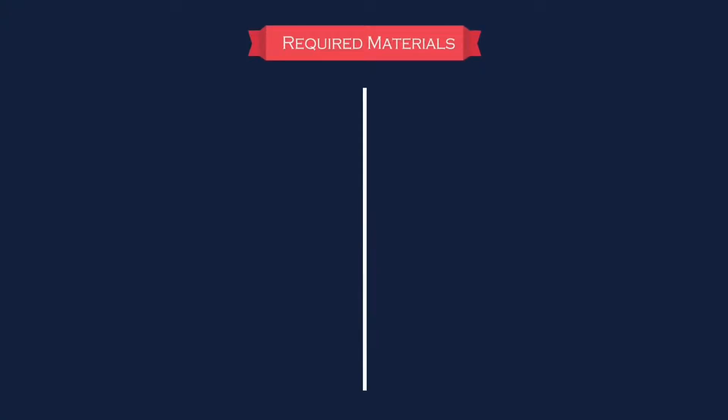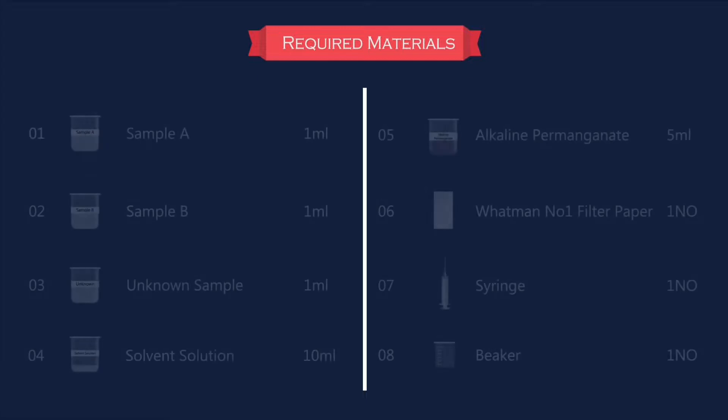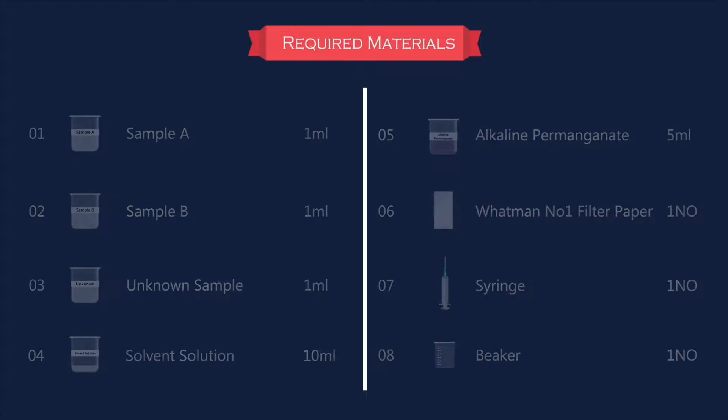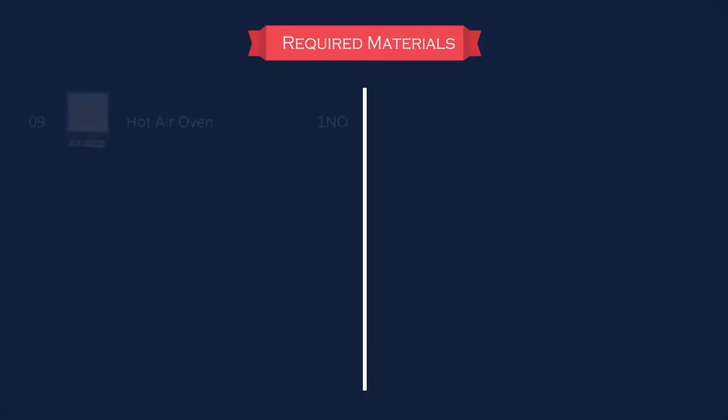The required materials are Sample A, Sample B (in this case glucose and fructose), unknown sample, solvent solution, alkaline permanganate, Whatman filter paper, syringe, and hot air oven.